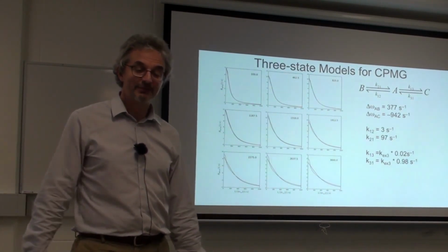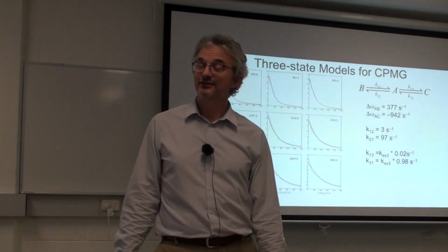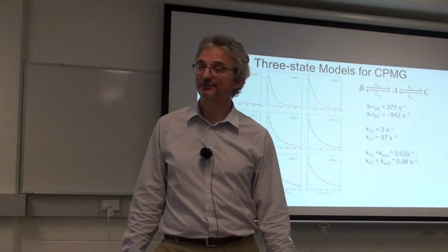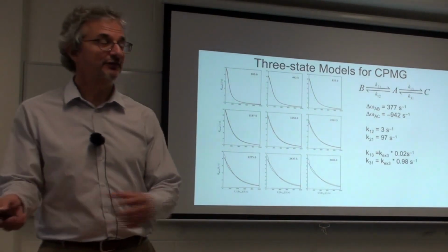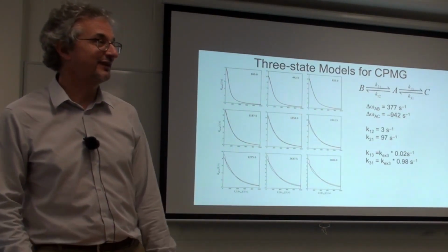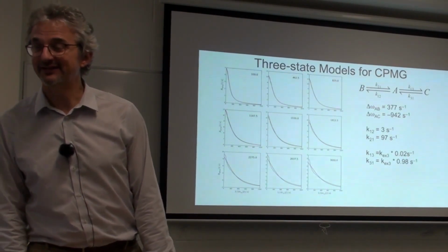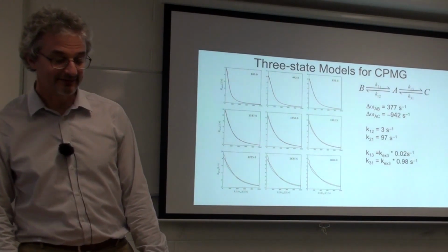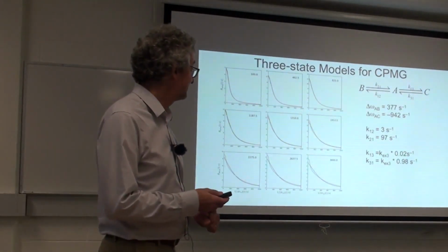Or you may be able to hypothesize what states you have, perhaps from your biochemical data, and then hopefully use mutations or some other perturbation to shift the relative populations of the states around as a way of trying to convince yourself how many states there really are, or how many detectable states. It's not a simple problem at all.